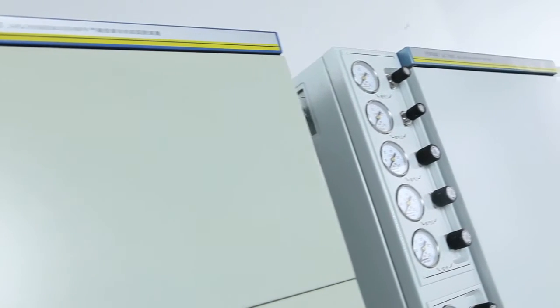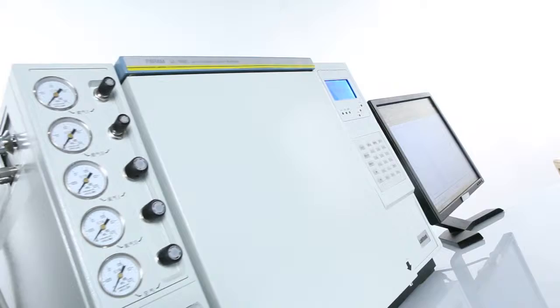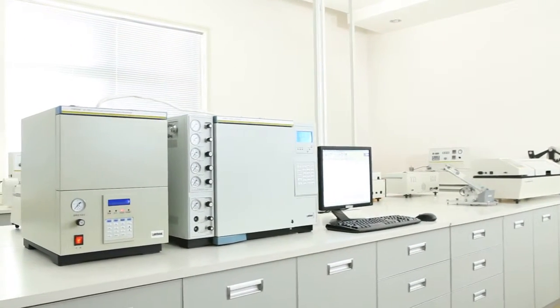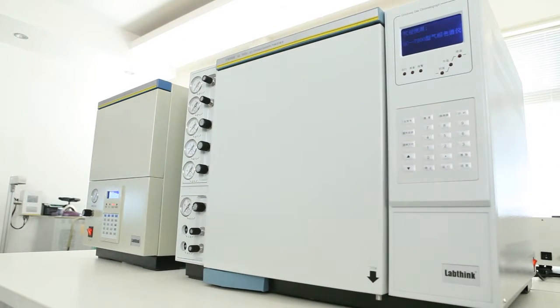The GC7800 Automatic Organic Solvent Residue Analyzing System is LabThink's latest gas chromatography system, designed for measuring the quantity of organic solvents left on printed packaging products.